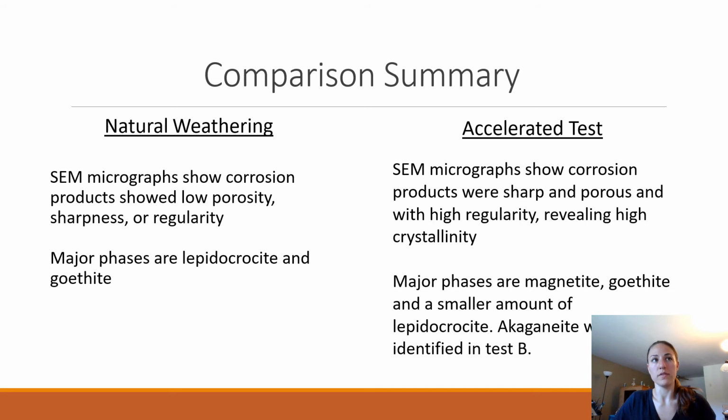So what we've learned is really natural weathering and accelerated lab corrosion testing is not very well correlated. However, this is an industry standard, especially the ASTM B117, which is just the 5% sodium chloride test solution.